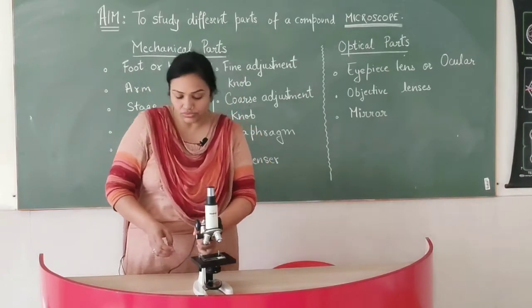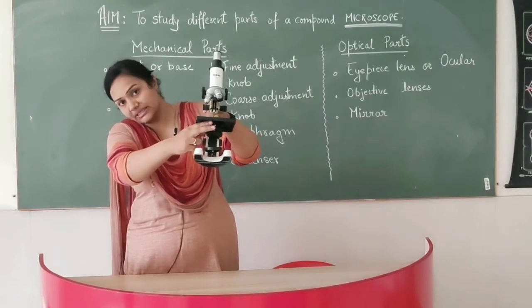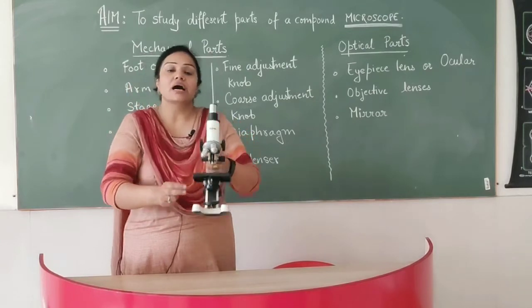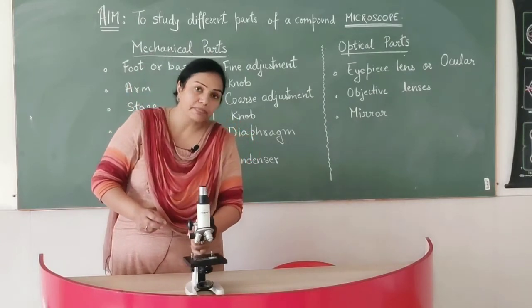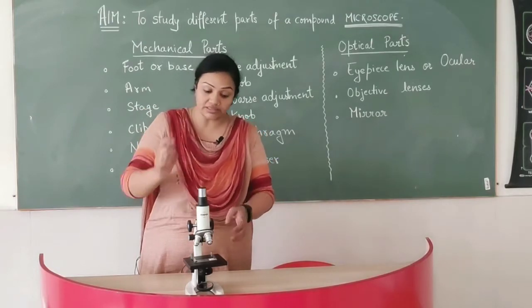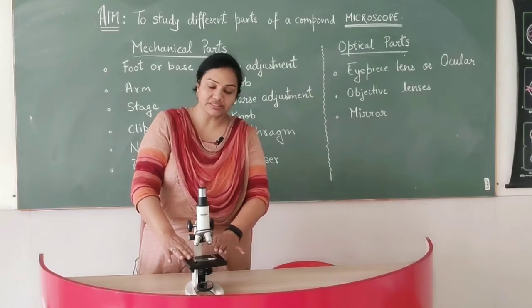Now coming to diaphragm and condenser. These two knobs you see here, these are diaphragm and condenser. They are helping and condensing to adjust the amount of light entering on the stage so that we can see the objects clearly.